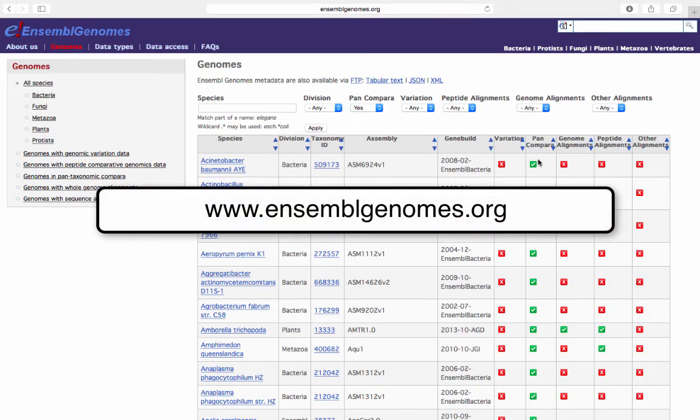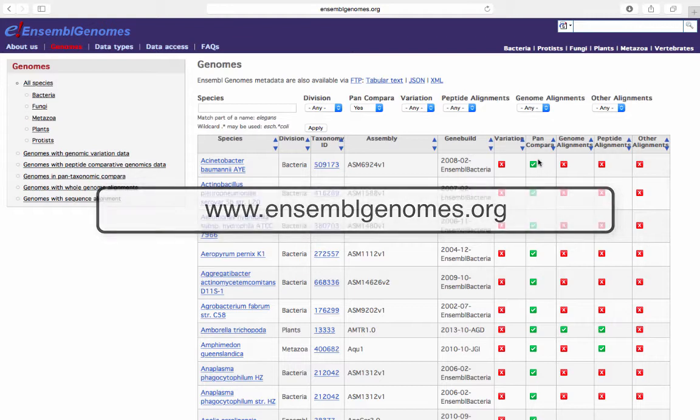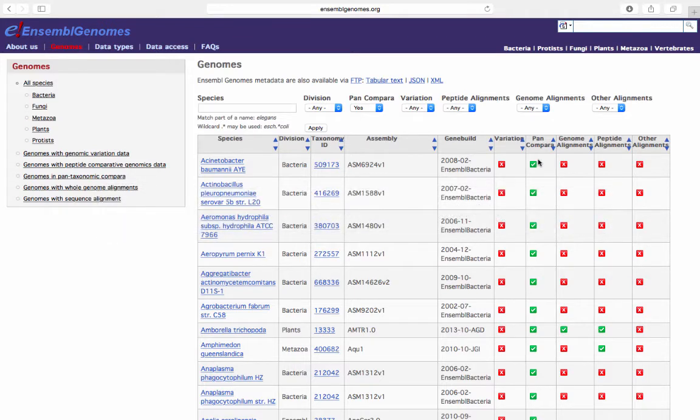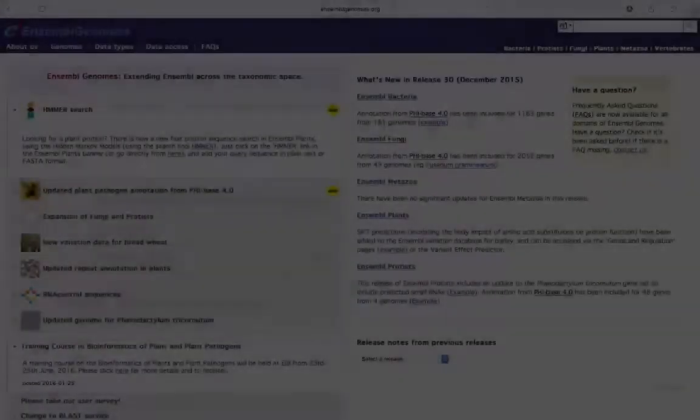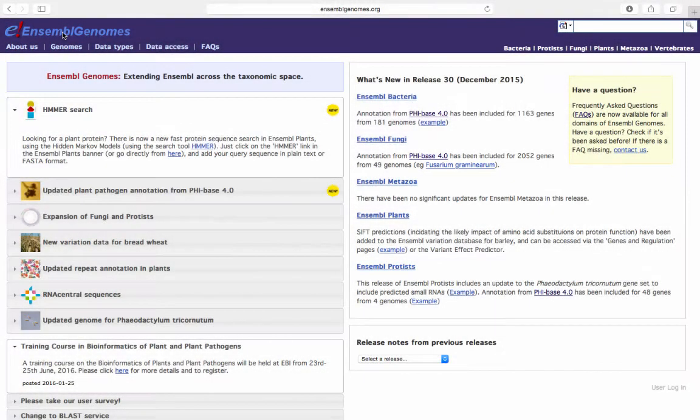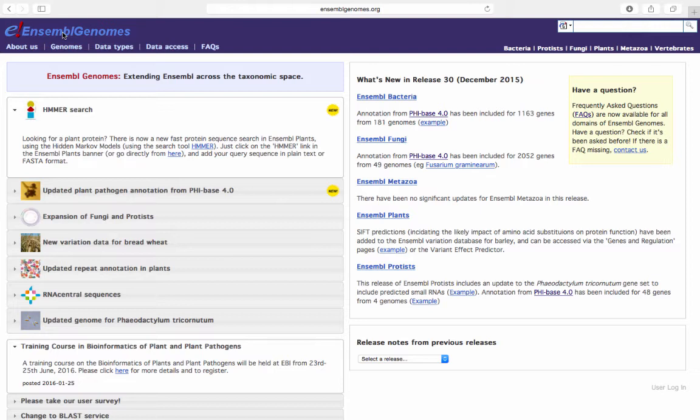Return to www.ensemblgenomes.org. From the Ensembl genomes homepage, we will navigate to the Ensembl metazoa homepage by clicking on the link in the blue bar in the top right-hand corner.